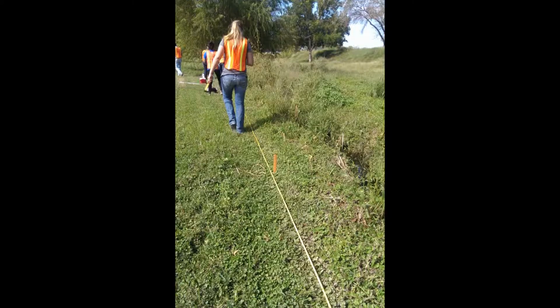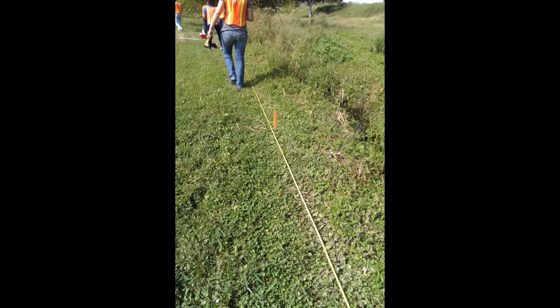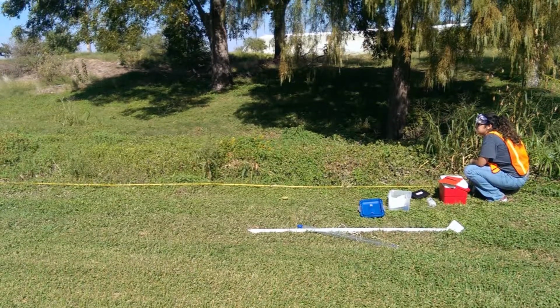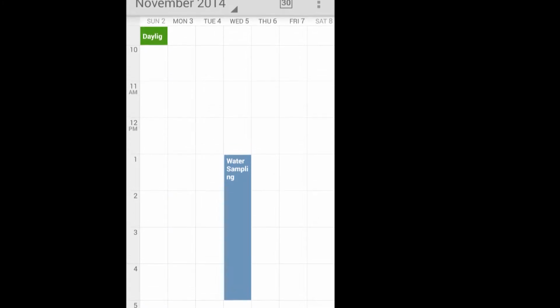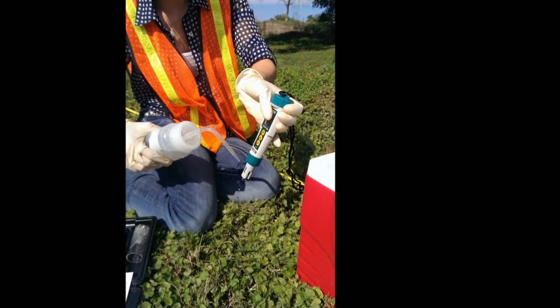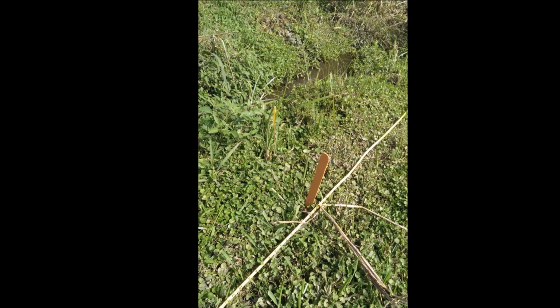Preparation. Determine the extent of the sample location, sampling methods to be conducted, and proper equipment to undergo successful sampling. Prepare schedules and coordinate with staff, client, and regulatory agencies if appropriate. Make sure to decontaminate and calibrate all needed equipment. Next, determine the sample location appropriate for your site.